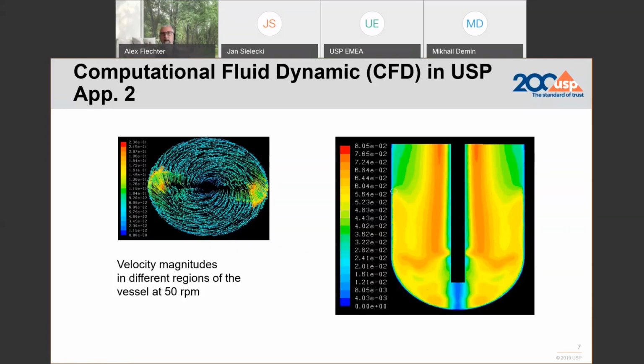Because with 50 RPM and only 30 minutes in the case of PVT or any immediate release drug product, or let's say slightly modified ones with a longer release characteristic, you will see differences in homogeneity, in concentration, eventually, especially with 50 RPM.